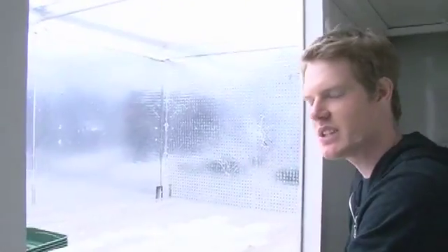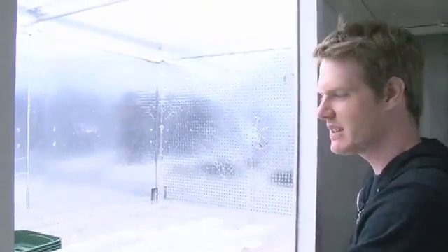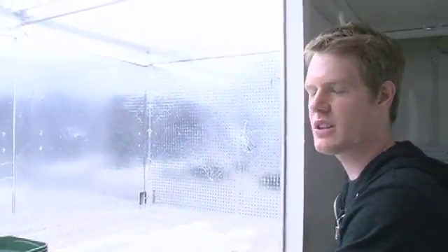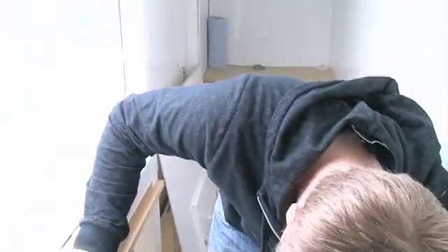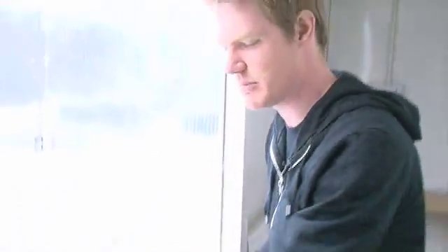It's about 20 degrees at the moment, but because we've opened it up it'll be varying slightly — it will stay exactly at 20 degrees. There might be a little bit of variation, which is why we've got three thermometers. We've got a humidifier down there to keep the ambient humidity quite high, and that will be on all the time when I start putting plants in there.